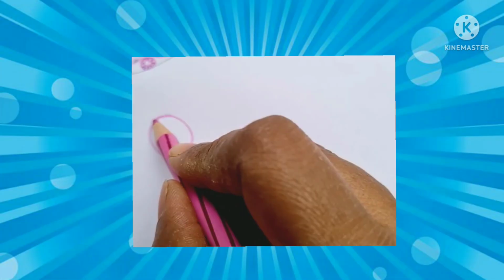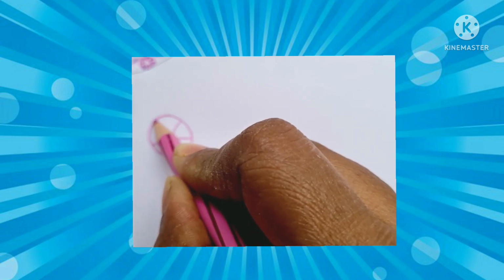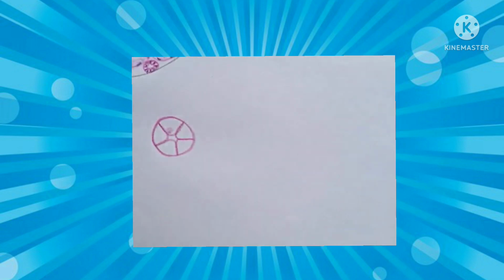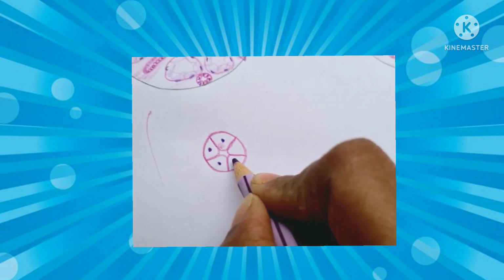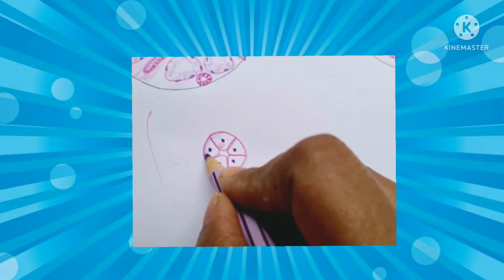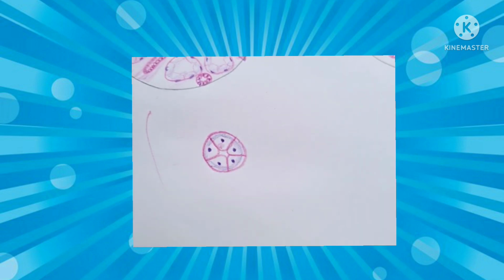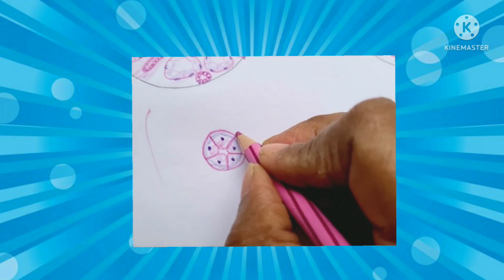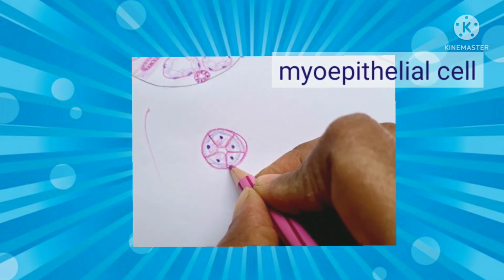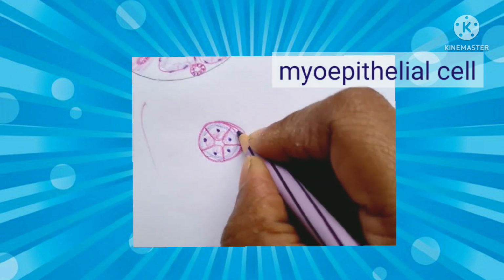Sometimes in the exam they will ask you to differentiate between serous and mucous acini. You have to know properly how to write. We discussed it already, but once again we'll refer. The serous acini, make sure it is round because it has a round acinar shape. The outline is round with a round nucleus, a narrow lumen, pyramidal cells, basal basophilic and apical eosinophilic.